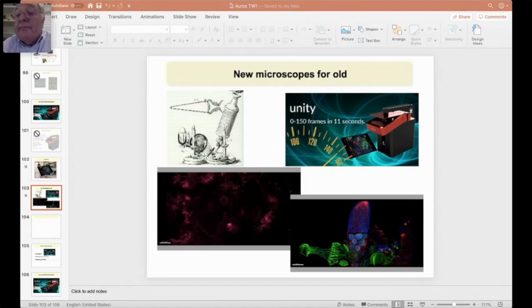Okay, we have a question here that I can probably answer. What is the SOM? Scanning optical microscope. It's one of the older ways of calling it, I guess. Yes, you see, when we started, we always called it a scanning optical microscope because it was a flying spot microscope, and the word confocal didn't come until later. Who coined it for the first time, I don't know. It could have been Fred Brakenhoff, as someone suggests. I really do not know. It's a thing we in Oxford used.